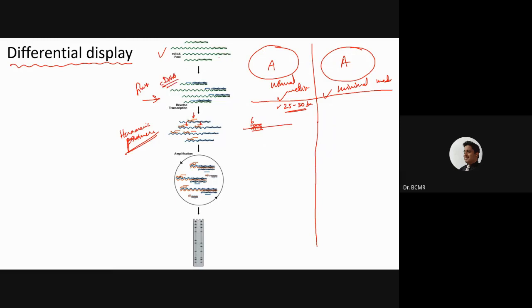of all the mRNAs. Okay, you have those. And now you are adding random or hexameric primers, and they can bind in different places. So each of them will generate a different sized fragment, isn't it? And when you take this pool and again amplify using the hexameric primers and also the oligo dT, you then perform PCR.